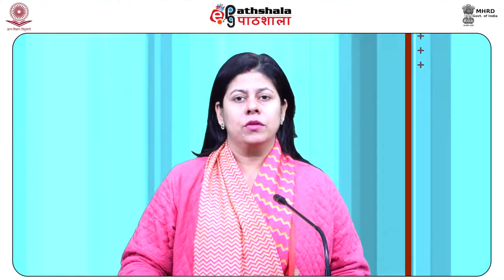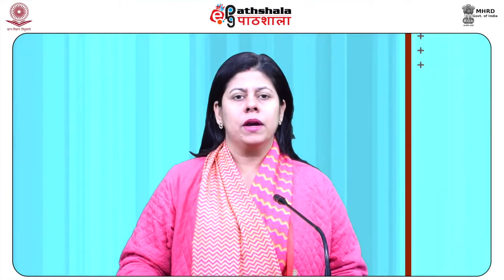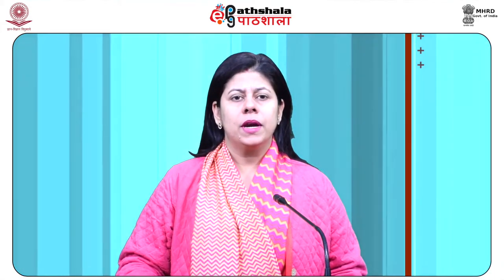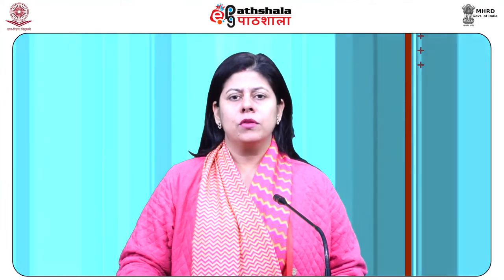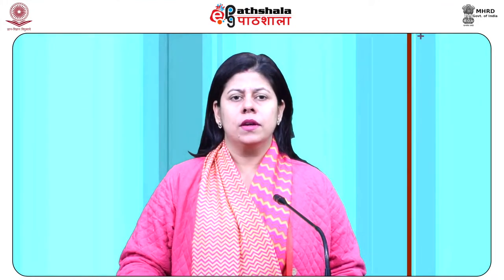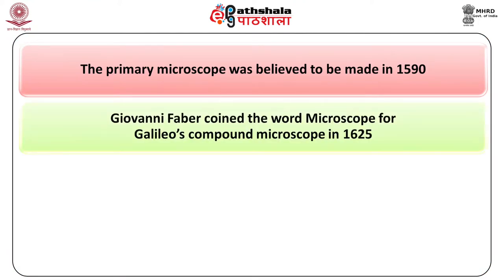There are numerous types of microscopes. An optical microscope is the most up-to-date and first manufactured microscope, which utilizes light to image the sample. Electron microscopes are another category of microscopes, which comprise the transmission electron microscope and the scanning electron microscope. The first microscope to be technologically advanced was the optical microscope, though the original inventor is not easy to recognize. The primary microscope was believed to be made in 1590. Giovanni Faber coined the word microscope for Galileo's compound microscope in 1625.